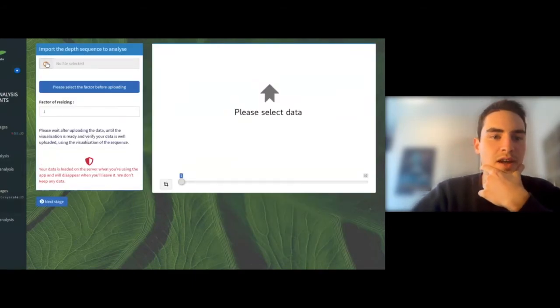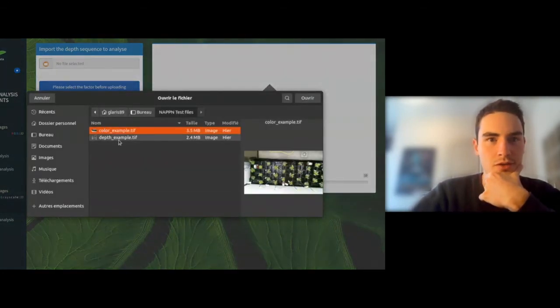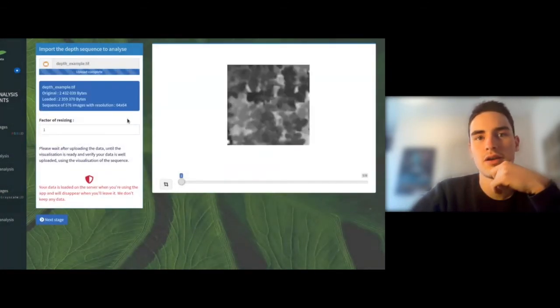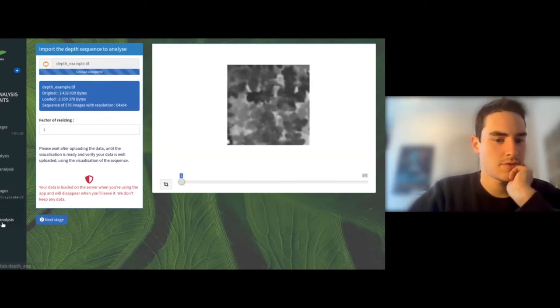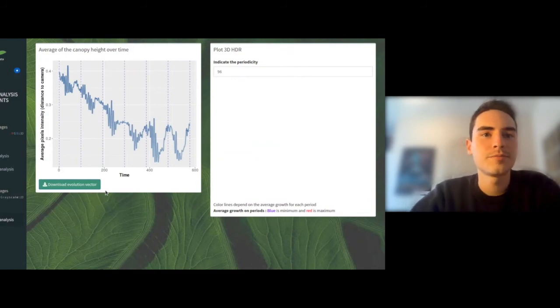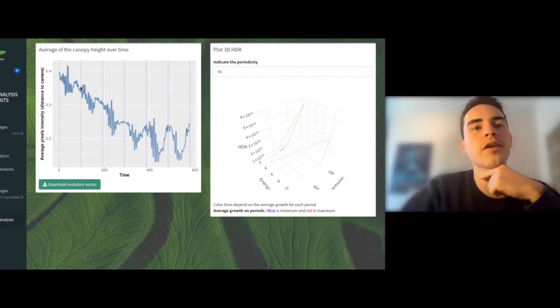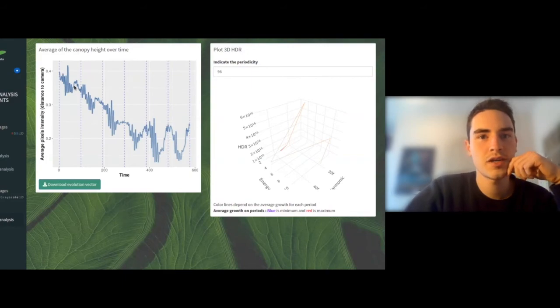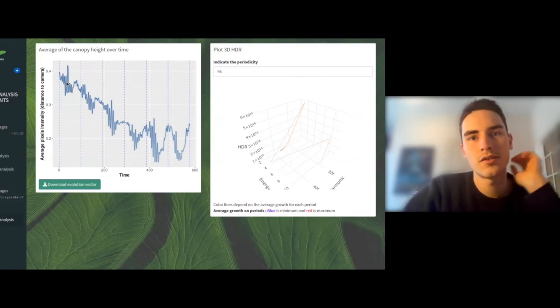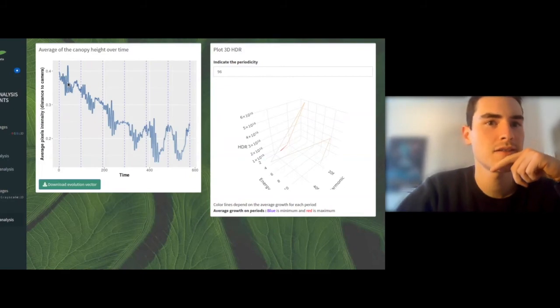Okay, so we can now move to the depth images. Here we have a canopy of hydrangeas in top view. We can go to the next step and the plot we can see on the left side of the screen represents the evolution of the average distance to the camera. And as David said previously, we can see period by period the trend, the circadian patterns, and the higher frequency patterns.